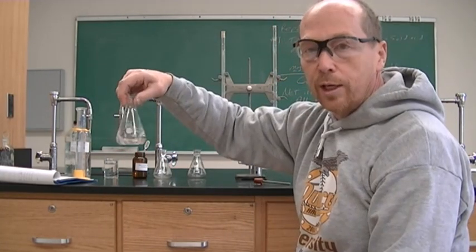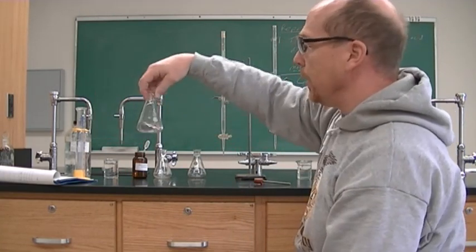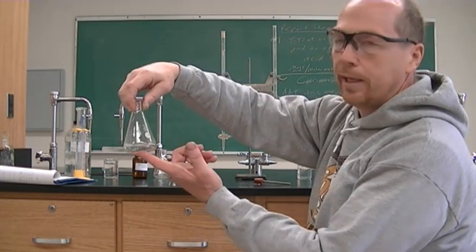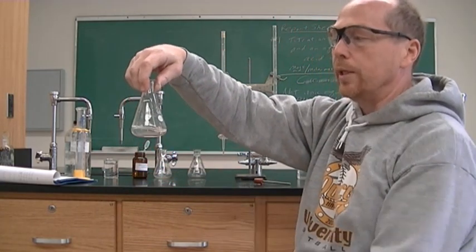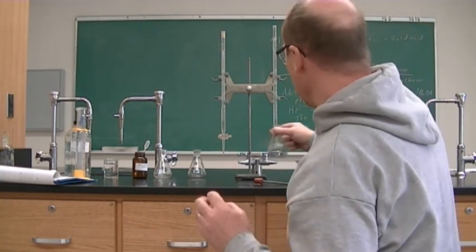Alright, so now I'm ready to do my titration. So I have my acid in here, and now I'm going to add my base. And when it is neutral, it is going to turn a light pink. Actually, it'll be slightly basic.